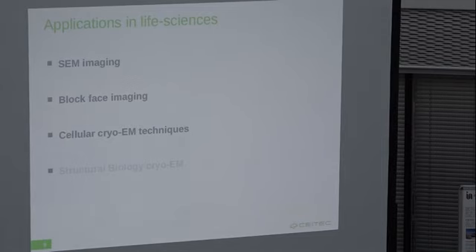What I'm going to talk about is what kinds of samples we can image in a SEM, and I'll try to tell you something about the specifics of sample preparation. Then I decided to tell you something about block-face imaging, and of course in the end something about the cryo techniques, because that's the hype of recent times.